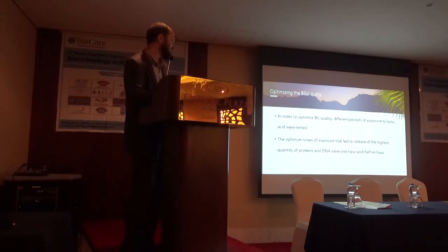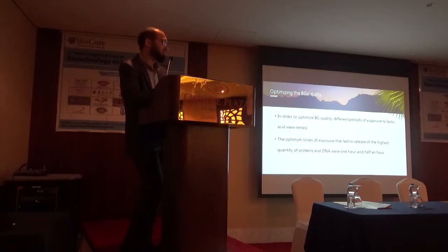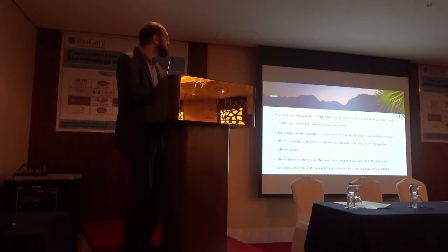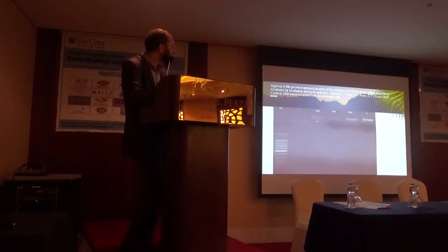In order to optimize the quality, different periods of exposure to lactic acid were tested, as I mentioned: 20 minutes, 30 minutes, 1 hour, 2 hours, and 3 hours. The highest quantities of proteins and DNA were at 1 hour and half an hour respectively. So we chose 1 hour. In gel electrophoresis analysis, DNA was extracted from the pellets of untreated and treated cells, showing differences in band intensity.